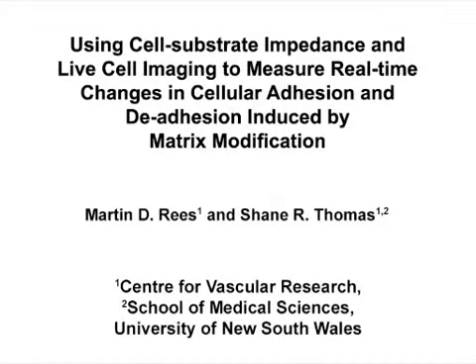The overall goal of the following experiment is to quantify rapid changes in cell matrix adhesion in endothelial cells exposed to matrix-modifying agents in real time using cell-substrate impedance and live cell imaging. In this experiment, the heme enzyme myeloperoxidase is employed as a pathophysiologically relevant matrix-modifying agent.